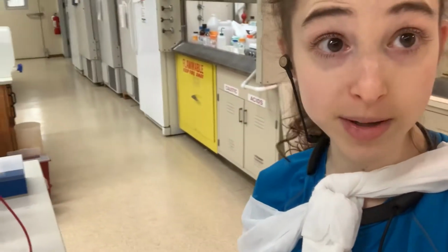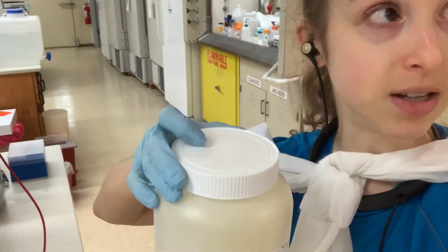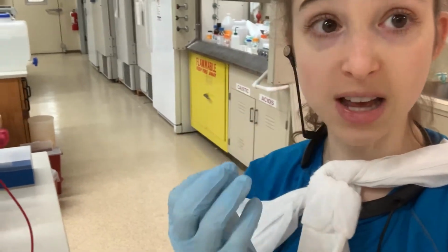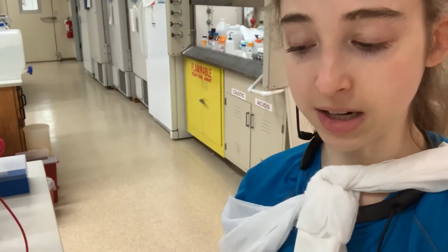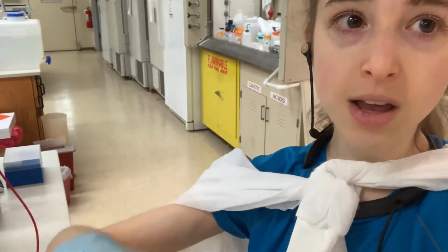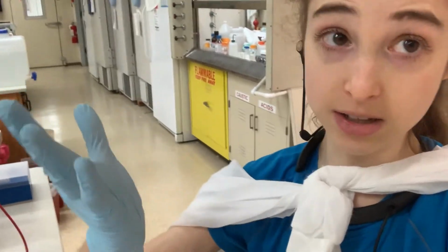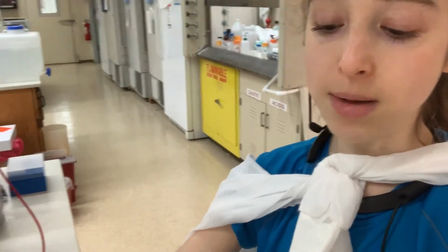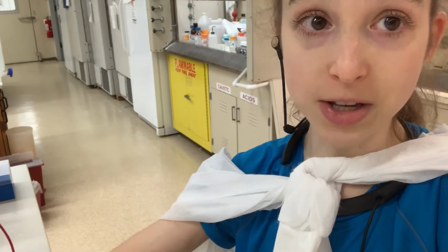And to avoid having big chunks, make sure that you keep the lid sealed tightly, because if water gets in, then it can cause that clumpiness for some of the things that are hygroscopic, so they suck in the water. But anyway, you don't want to fill the water all the way to the line. Firstly, because those lines are only approximations, remember, so you could easily overshoot. And second, because the solid you're adding is going to add volume. And so the final volume is going to be more than the amount of water that you had in there.